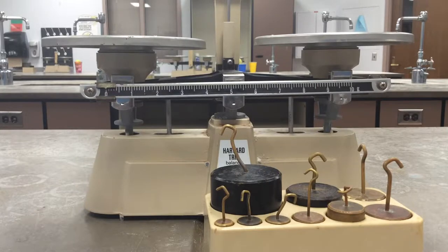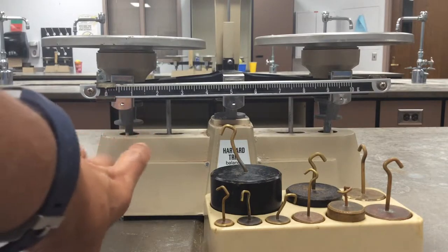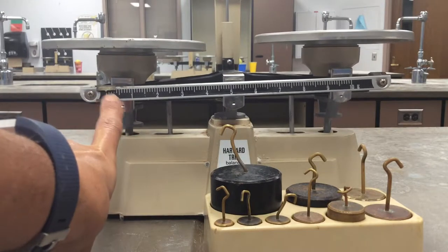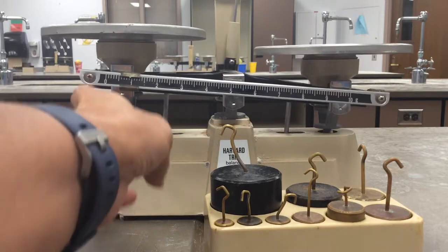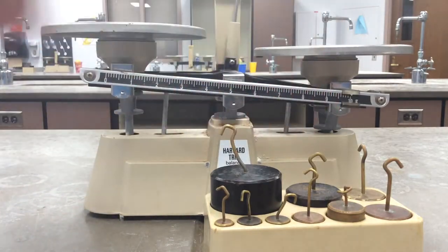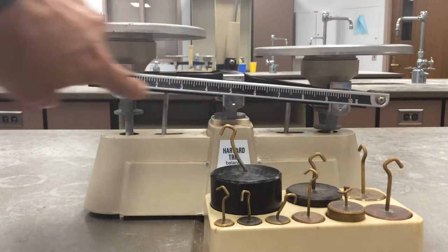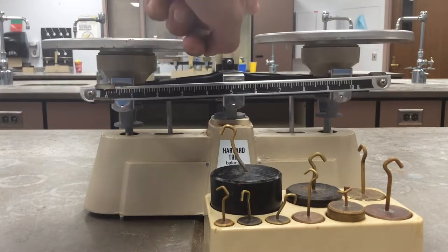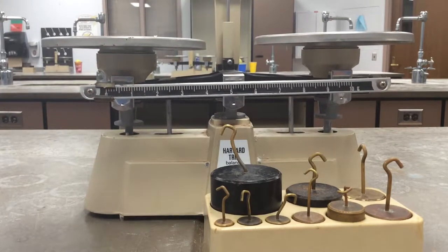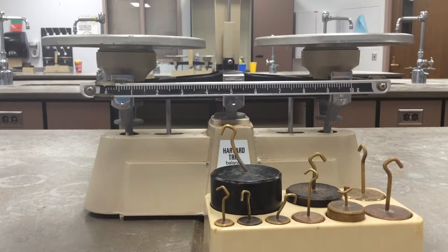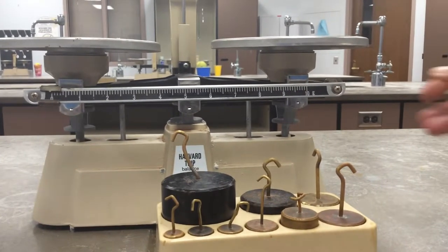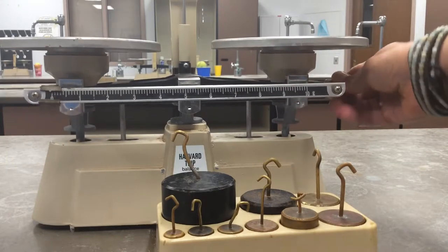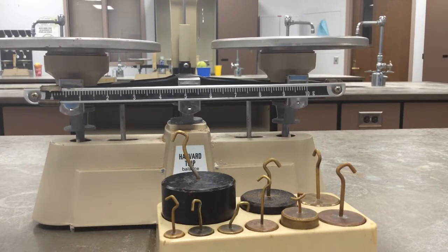So when you get into your lab, make sure always that the rider, this right here, you notice that it can go up to 10 grams, so we want to make sure that's always set to zero so that our little tiny pointer is at zero and it's balanced. You might have to occasionally use the adjustment knob to get that evened out, but this one I have already set.